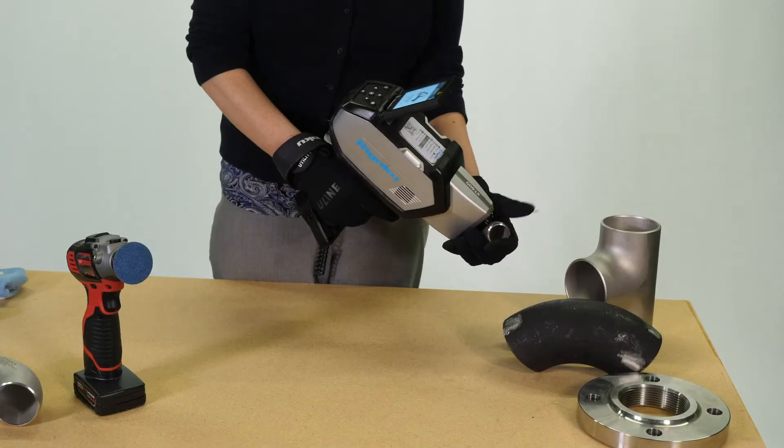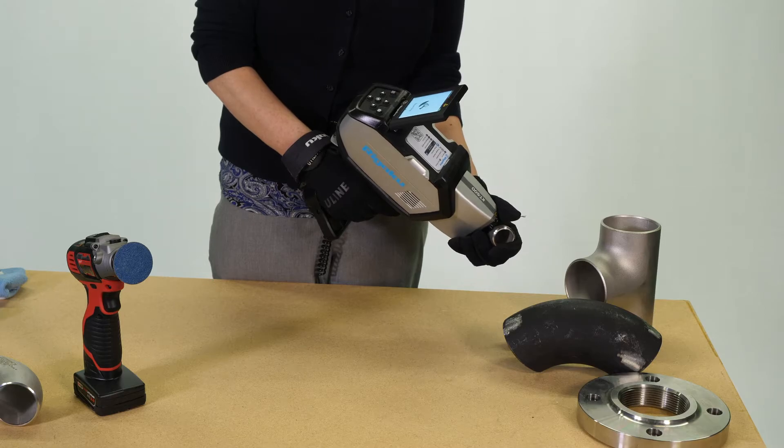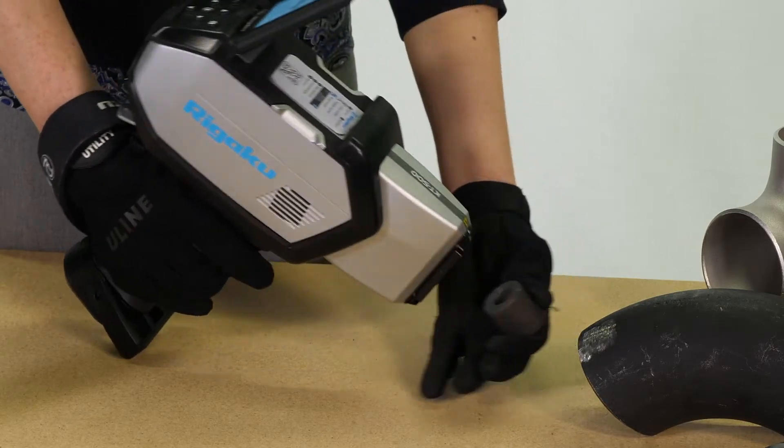Purpose-built to analyze all your carbon steel, chrome moly steels, stainless, and high-temp alloys such as cobalt and nickel.